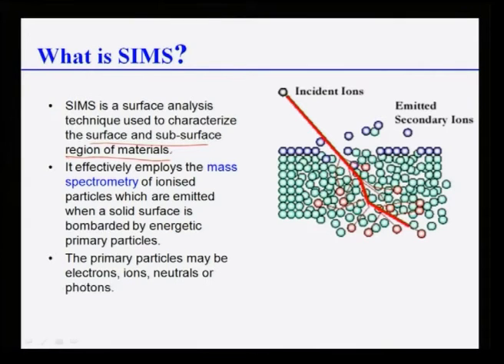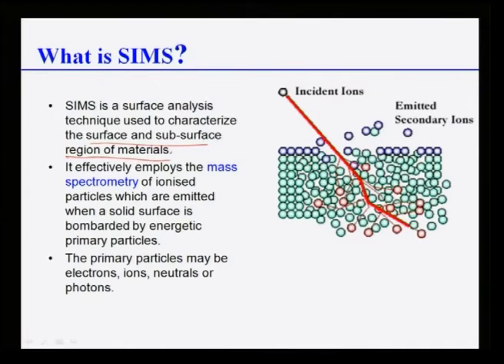That's what makes SIMS very popular. Even if you have a thin film on the surface of any material, you can analyze it, to ppm-level precision. It effectively employs the mass spectrometry I discussed, of ionized particles which are emitted when a solid surface is bombarded by energetic particles. The schematic diagram on the right side is showing this picture.